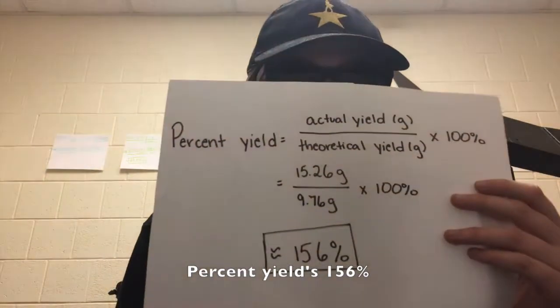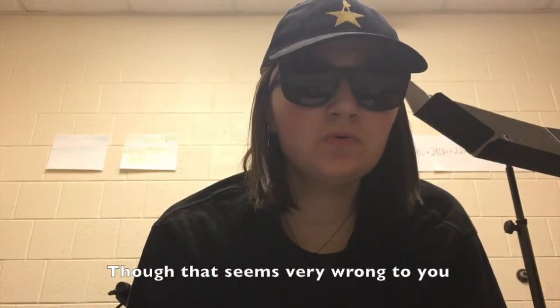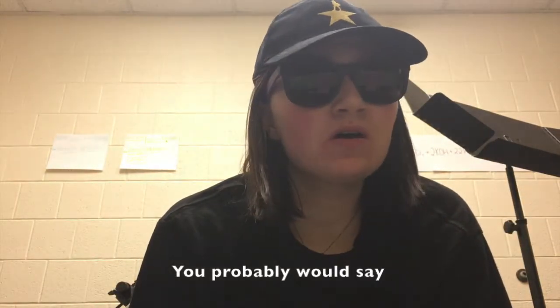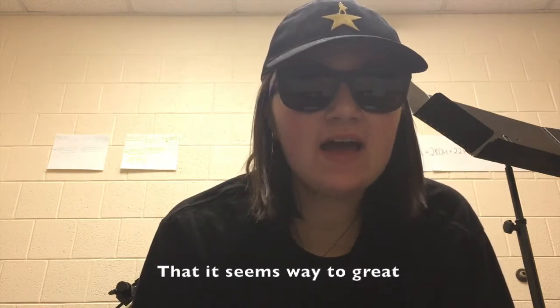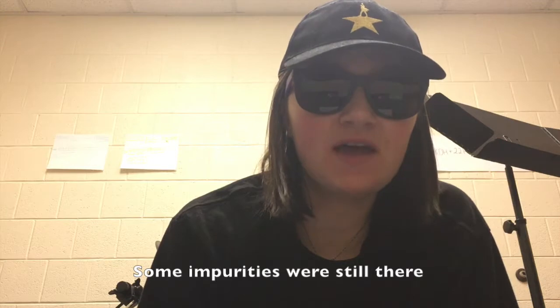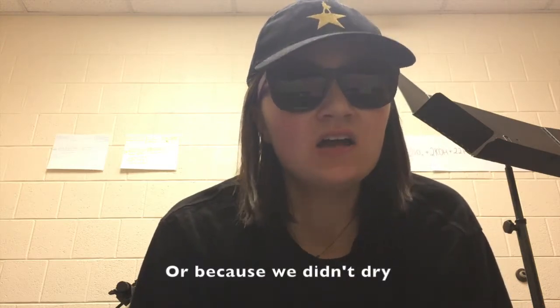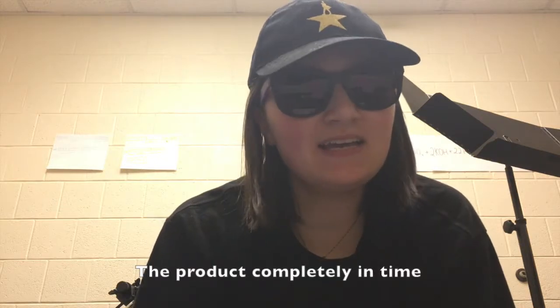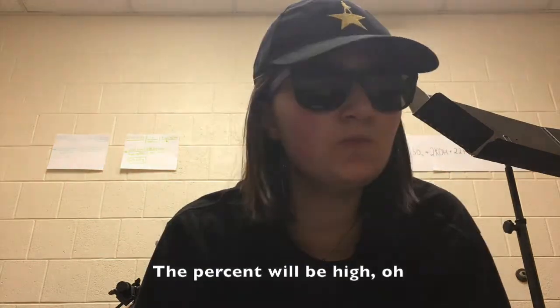Percent yield is 156. Though that seems very wrong to you, you probably would say that it seems way too great. But that's probably because some impurities were still there, or because we didn't dry the product completely in time. The percent will be high.